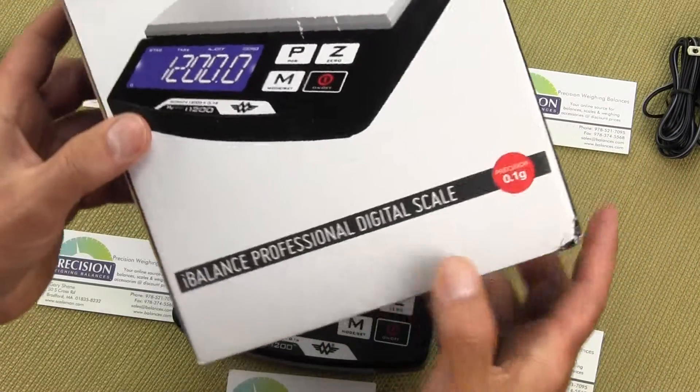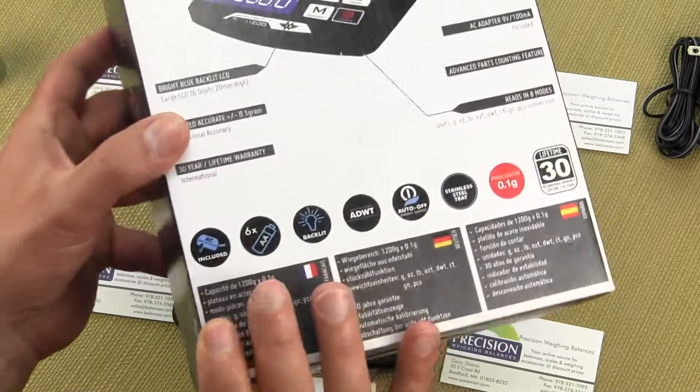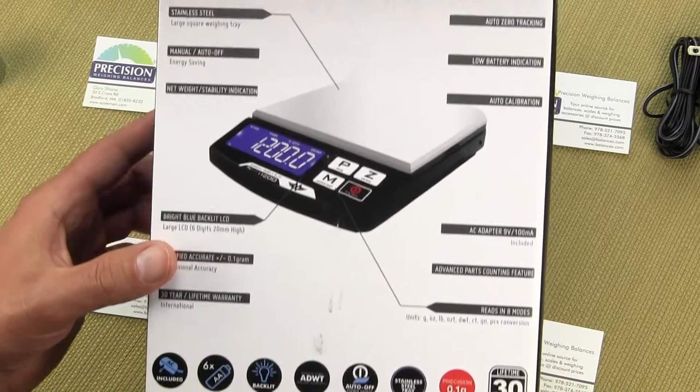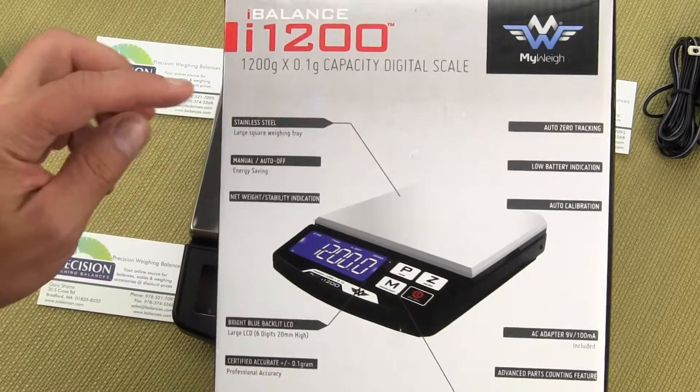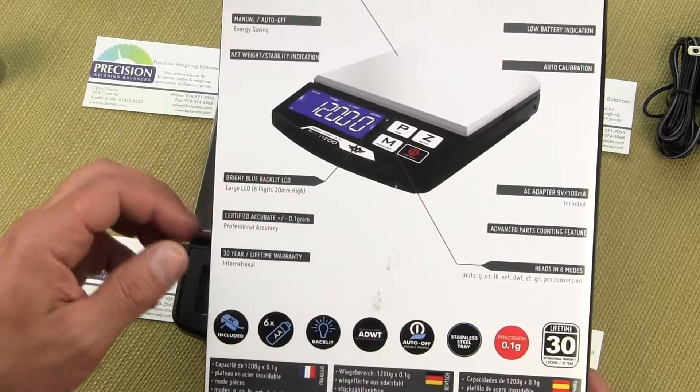The box shows the product very clearly, and on the rear of the box it shows you each of the features that the balance offers.